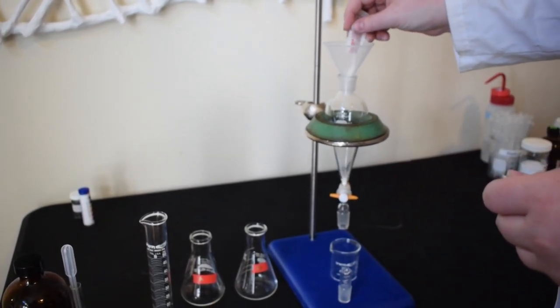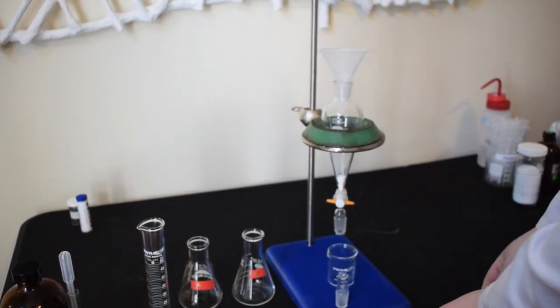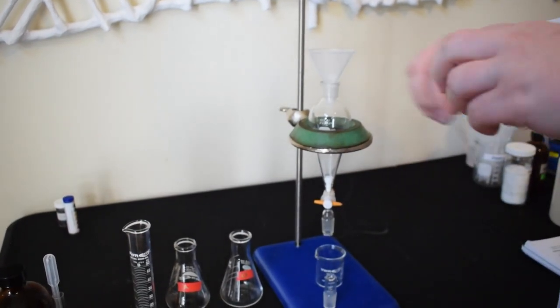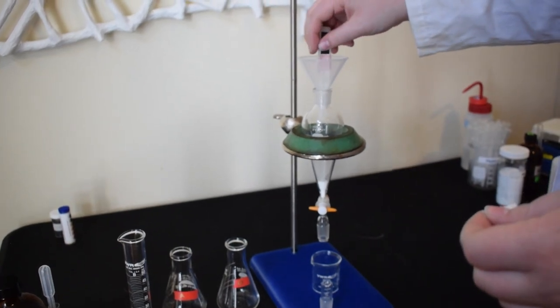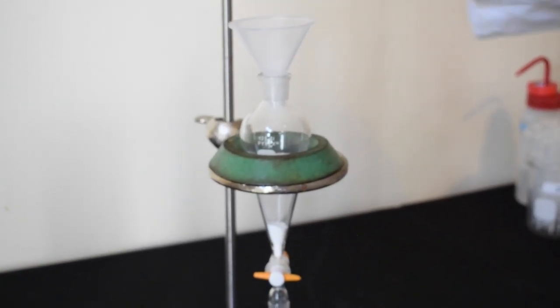So we're going to start by adding two packets of Goody's powder into our separatory funnel. Keep in mind for your theoretical recovery calculations that there are 500 milligrams of aspirin and 325 milligrams of acetaminophen per packet.